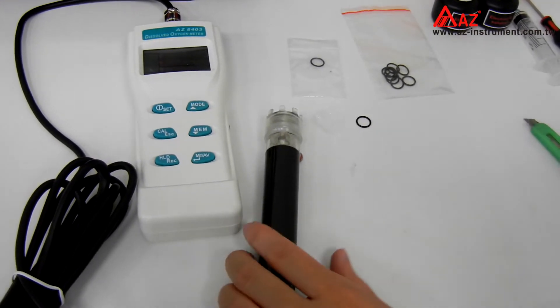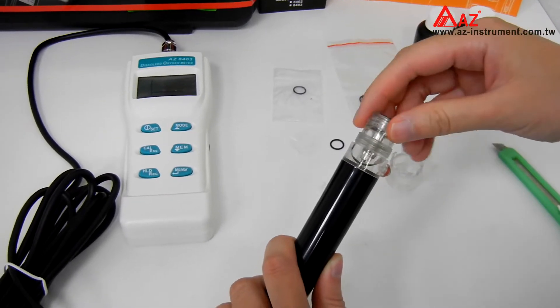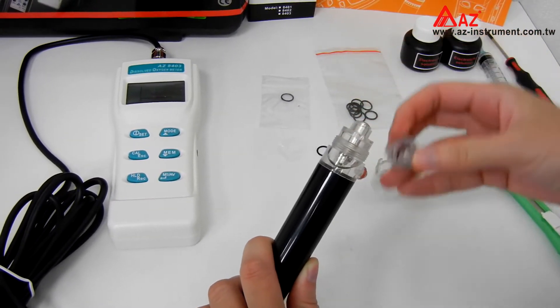First, unscrew the probe guard. Then remove the old membrane and O-ring.